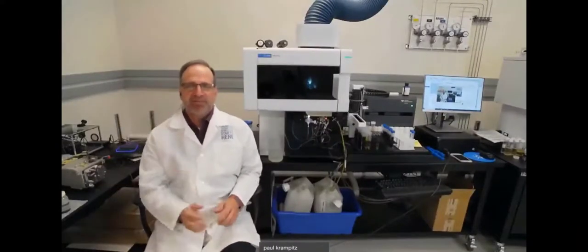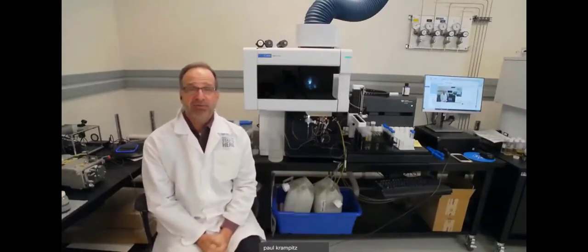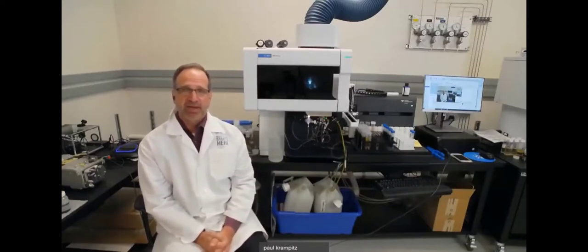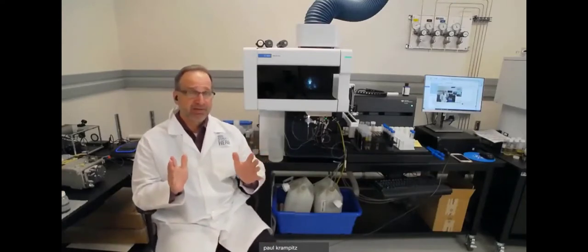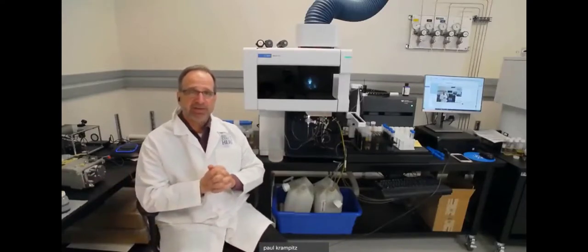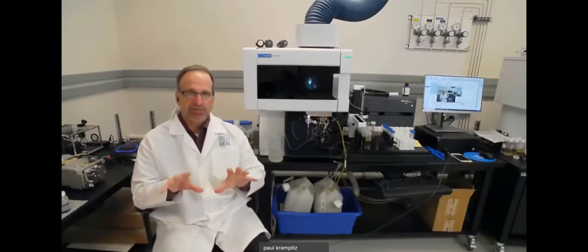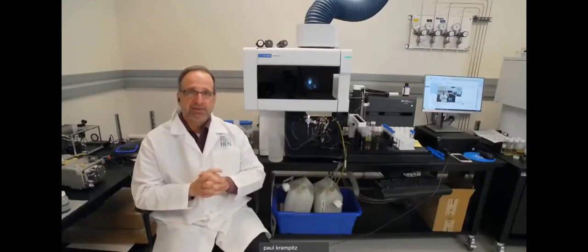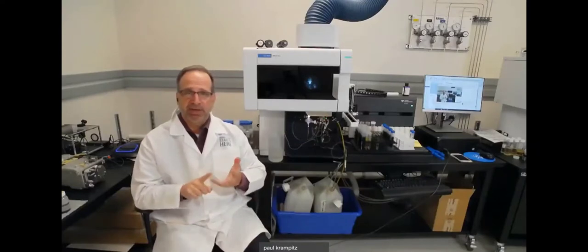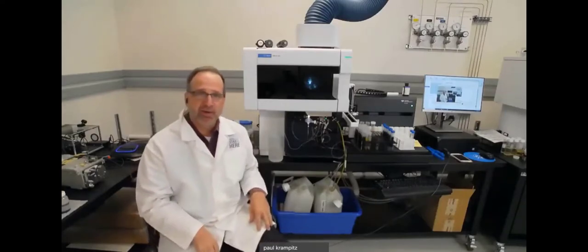Hello, everyone. Once again, I'm Paul Krampitz, application scientist here in the Wooddale COE, Center of Excellence. And you are now on a virtual tour on our second stop, I think, and this is the ICP lab. Your timing for the virtual meeting here is absolutely perfect because I'm right in the process of running a lot of oil samples for an application study we're doing, wear metals in oils, and all kinds of different engines, engine oils, transmission oils, swing gearboxes, all kinds of different things on engines that are used to build and disassemble railroads. So kind of a really nice cross-section of oils that we're running here.